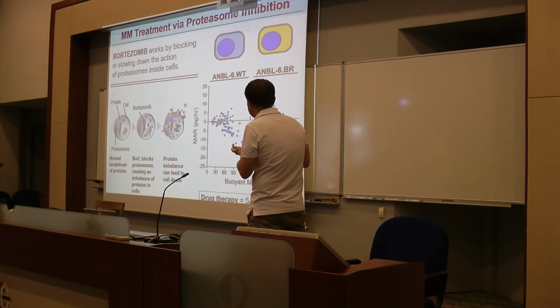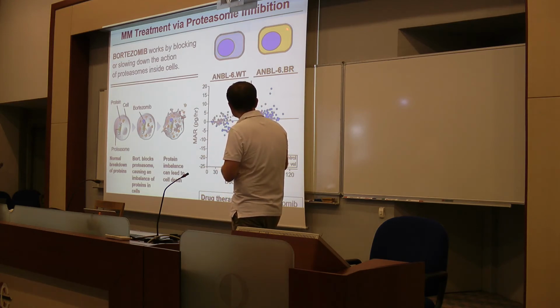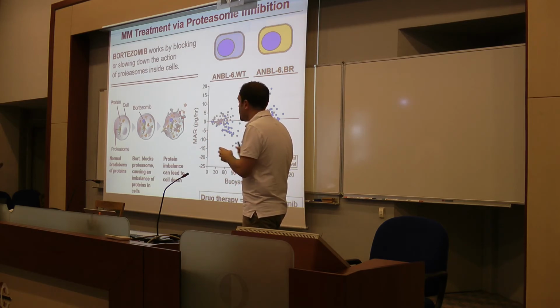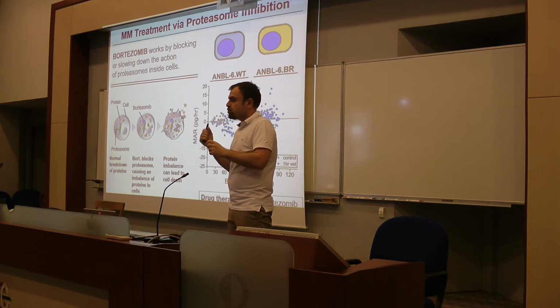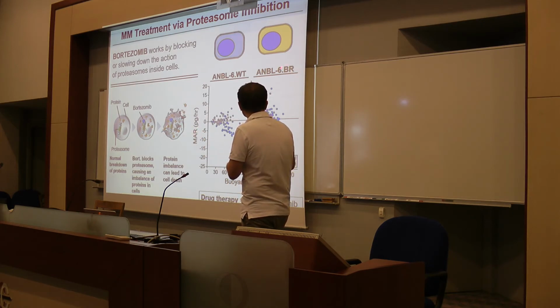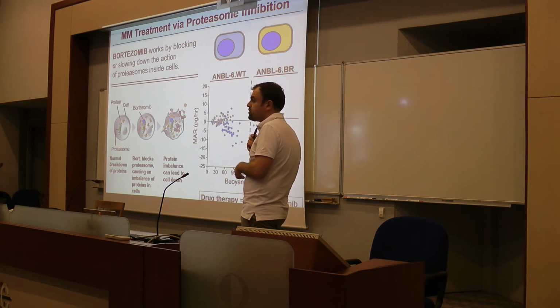So we use this phenomenon to determine how chemotherapy drugs affect the cancer cells. For example, here we have two cancer cells of the same family. We have a wild type, which is sensitive to that particular drug, and this is the resistant one. What they do is produce this resistant cell line: you have a population, you drug them, and you pick the ones not dying. So you take them, clone them, and then make that resistant population. When you drug the cells, the wild type starts to lose weight, which means they're dying, and you see almost negligible variation in the cell mass for the resistant one.